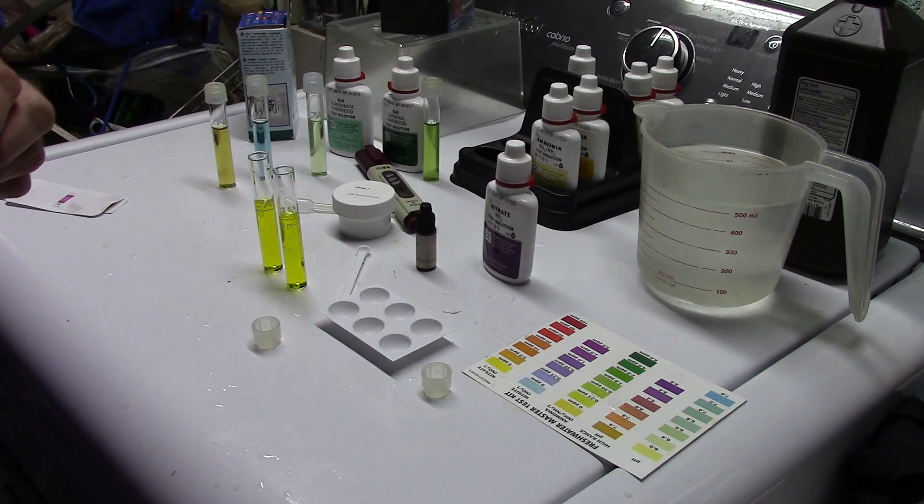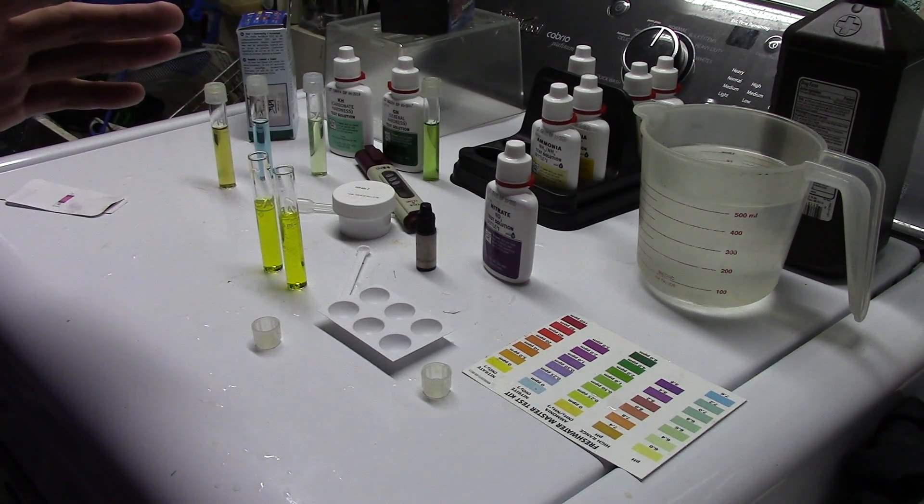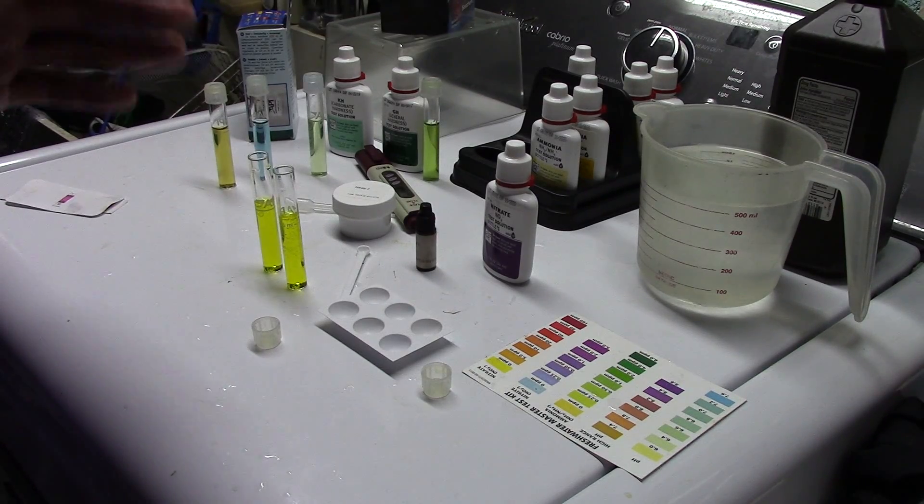So we're going to do a comparison today — we're going to see if the way I did it comes up any different than the way the instructions say to do it. I always recommend doing it the way the instructions say to do it.